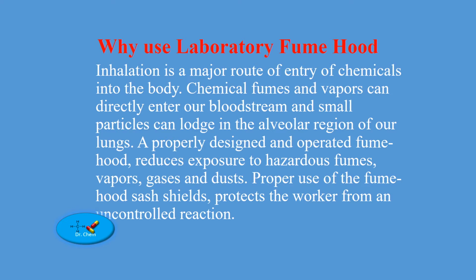Why use a laboratory fume hood? There are three ways in which chemicals can enter our body: through inhalation, ingestion, and direct contact. Inhalation is a major route of entry of chemicals into the body. Chemical fumes and vapors can directly enter our bloodstream, and small particles can lodge in the alveolar region of our lungs. A properly designed and operated fume hood reduces exposure to hazardous fumes, vapors, gases, and dusts. Proper use of the fume hood sash shields protects the worker from an uncontrolled reaction.